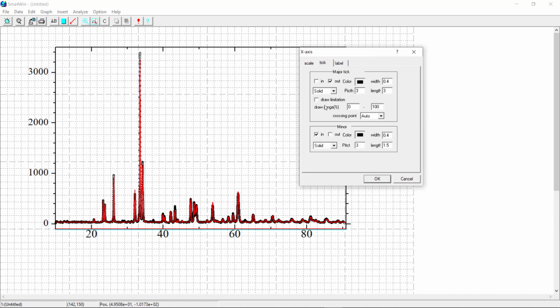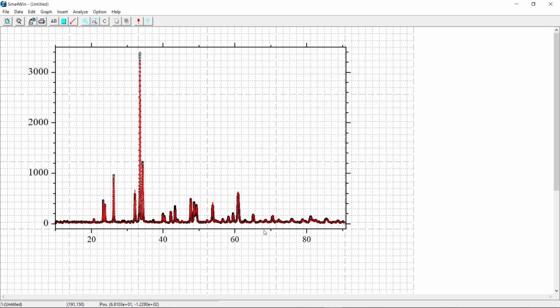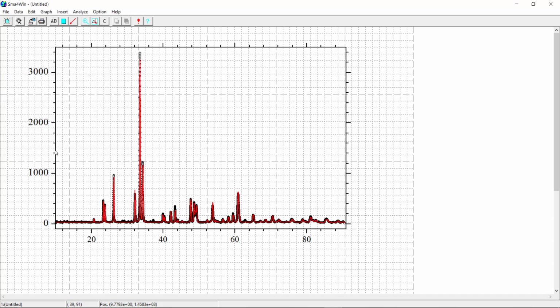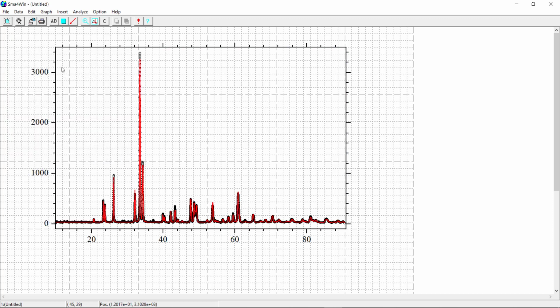Take out label 20, or usually 18 down 5, like that. So I must do probably, okay, this one could be 5. Great. Label is 18.